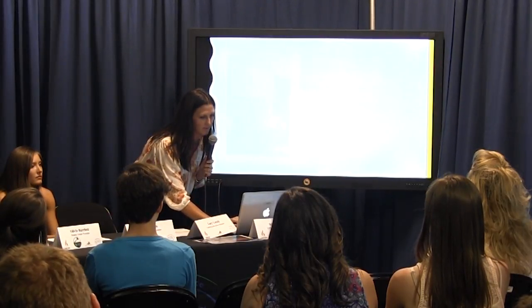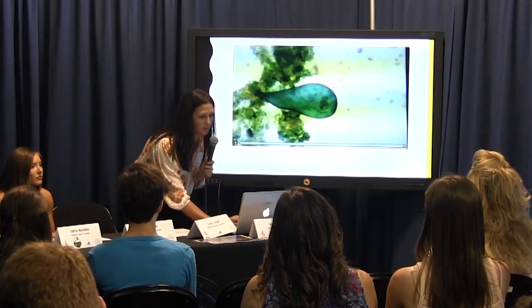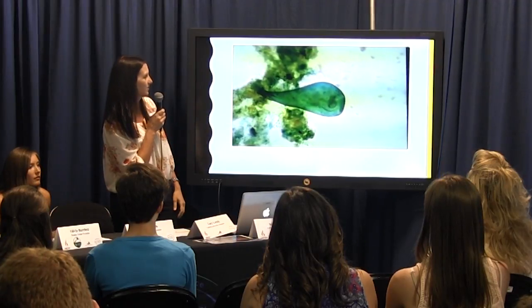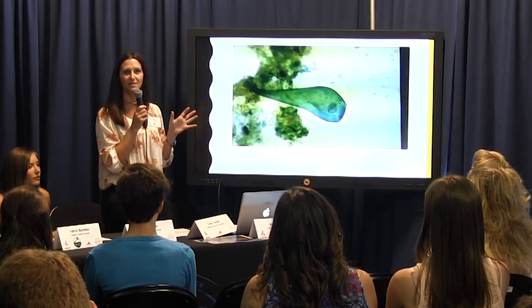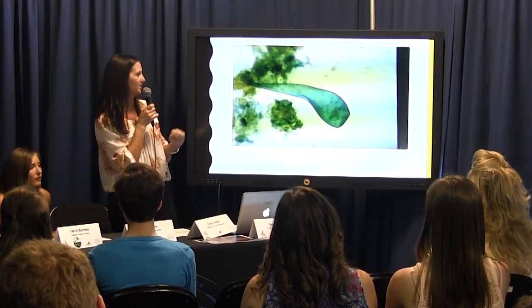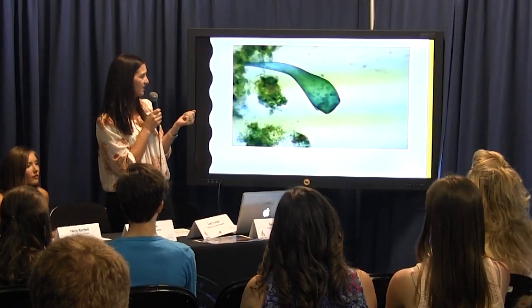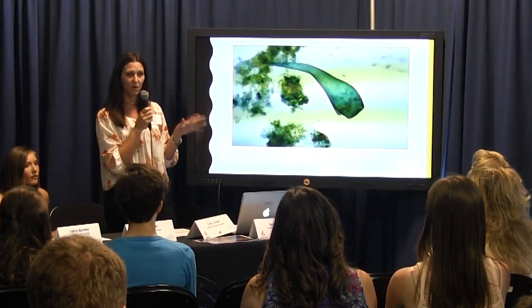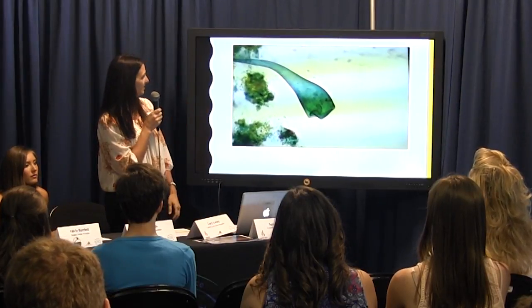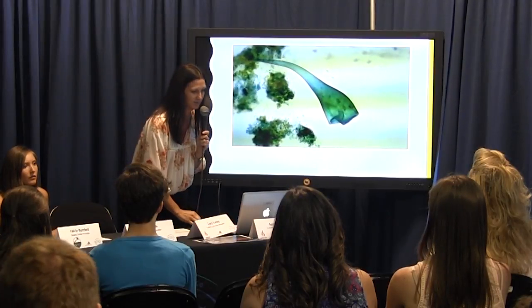Let's go to the last one. So I thought here was another really good one. This was on the teacher one, so I had to actually video my TV while that was going on. So this was one of those rare moments, and this is Stentor sort of stretching out. So we've studied all these bacteria, viruses, various protists, protozoa, algae, fungi, but now they get to see some of that in action.